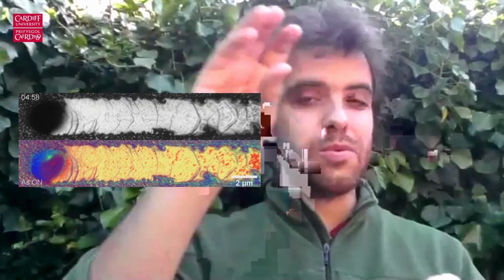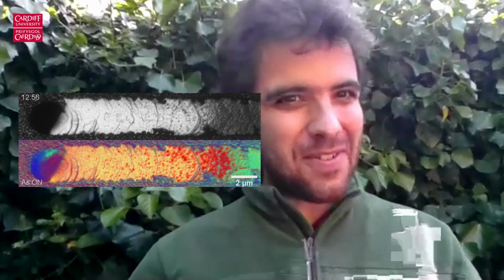The last slide is effectively just to show you a few videos that we have recorded very recently. In the first case, we have two representations of the same thing, one in black and white, one in color. The color represents the different arrangements of the atoms on the surface, right? So if you have yellow, the atoms will be arranged in one way. If you have red, the atoms will be arranged in a different way. If you have blue, the atoms will be arranged in a different way.